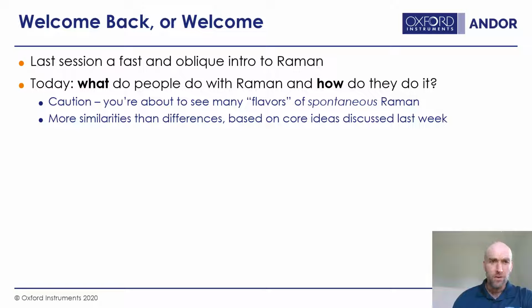Just first of note, you're going to see many different flavors of spontaneous Raman scattering. We didn't draw a distinction between spontaneous and stimulated Raman, mostly because stimulated Raman is a lot more complicated, requires a lot more hardware, in my opinion, and is a bit more specialized, or at least niche, perhaps because the experimental techniques are more difficult.